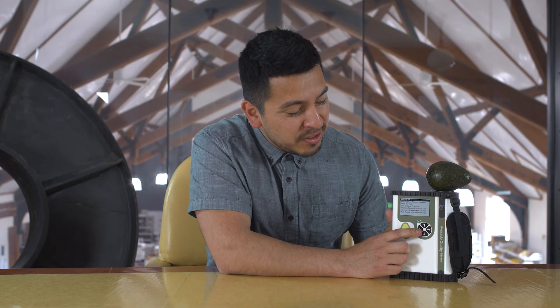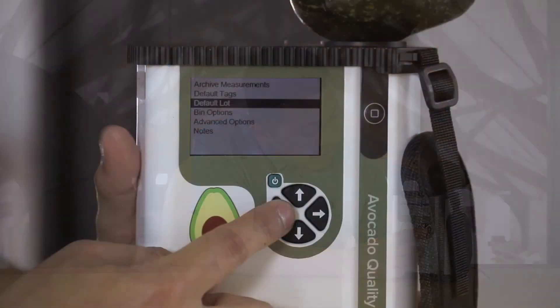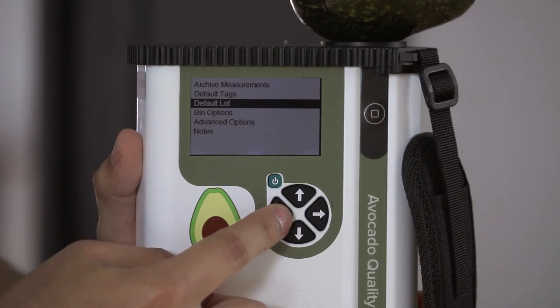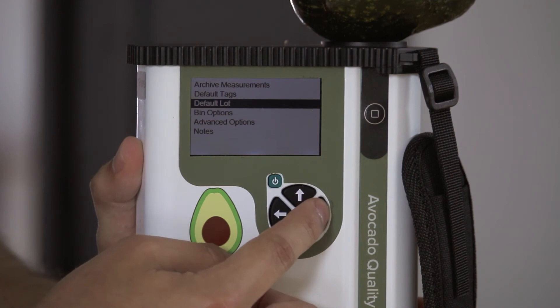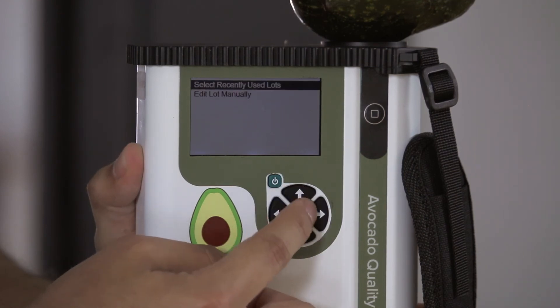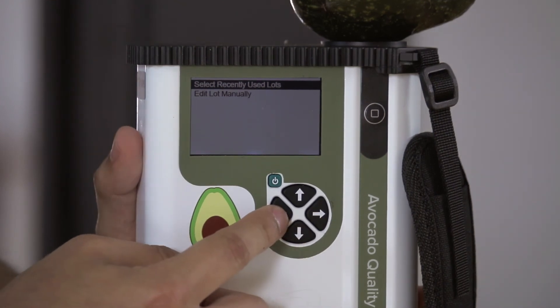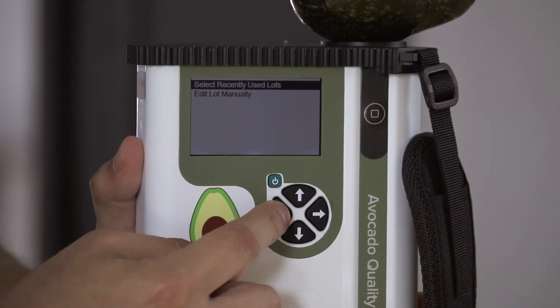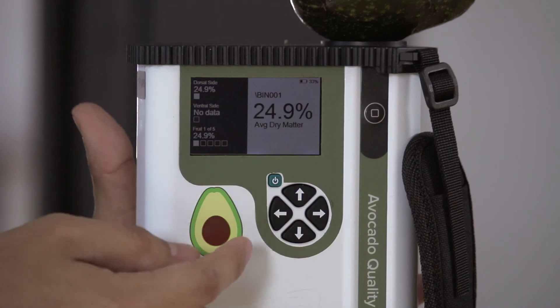To return to the previous menu, you use the left arrow. Within this menu, you are able to name your lots. Enter the default lot menu, where you have the option to select a recently used lot or enter the lot name manually. To return to the measurement screen, push the left arrow until your results are on display.